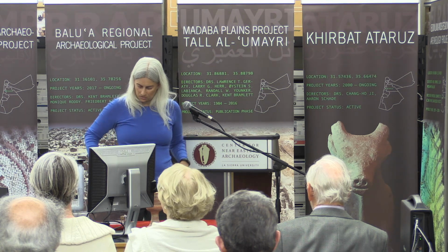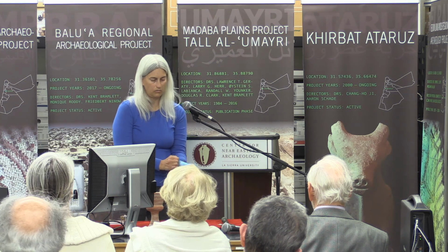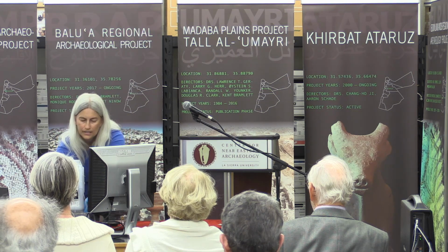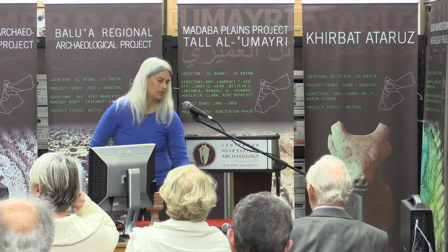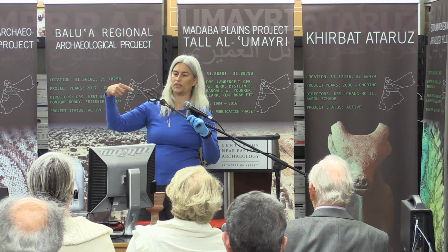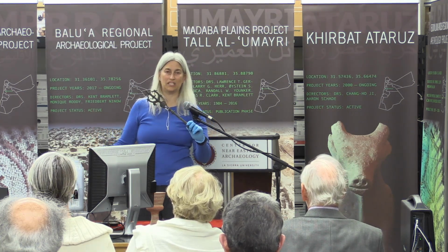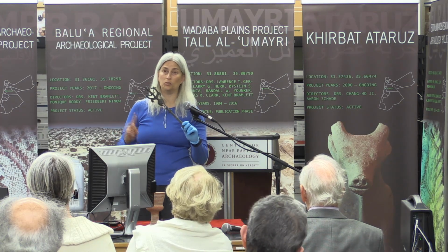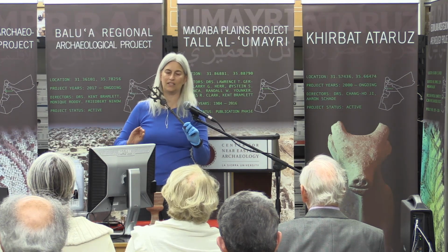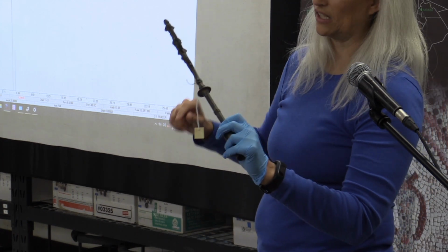So start with this. We're going to start with one larger piece of metal here. So we have this nice piece of metal. Now, anybody looking at this, I hope you look at this and say, yes, metal. Do I know what kind of metal? Absolutely not. So it would be really helpful when you're preserving things or figuring out what the technology is that made this, to know what is even in this metal. So we're going to take a scan of it.